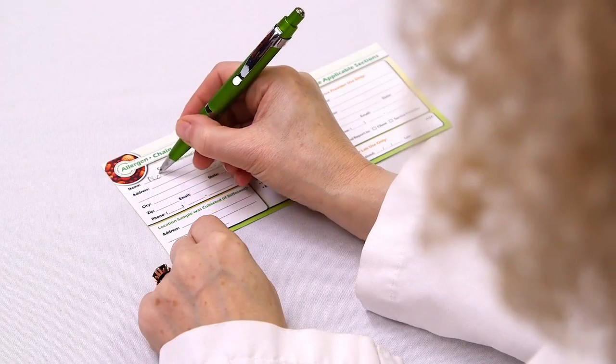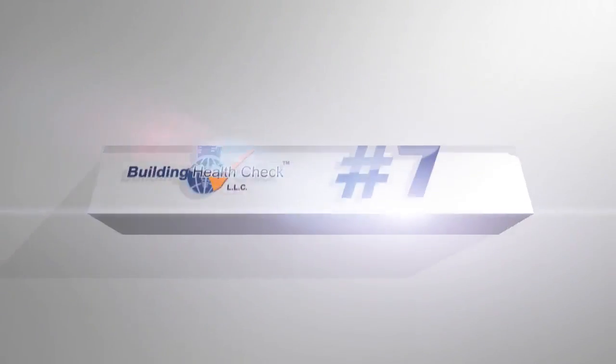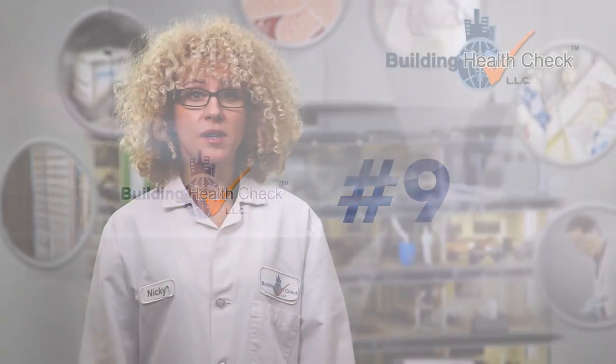Step 6: Complete the chain of custody in its entirety. Step 7: Place the plastic case and the chain of custody in the self-addressed envelope. Step 8: Mail the plastic case and the form to the lab using the prepaid envelope. Step 9: During normal conditions, you should receive your test results via email within three to five days.